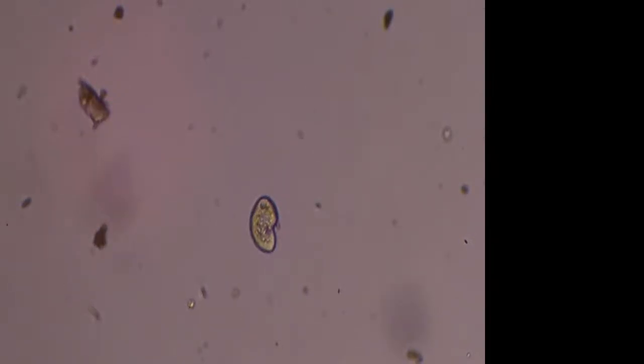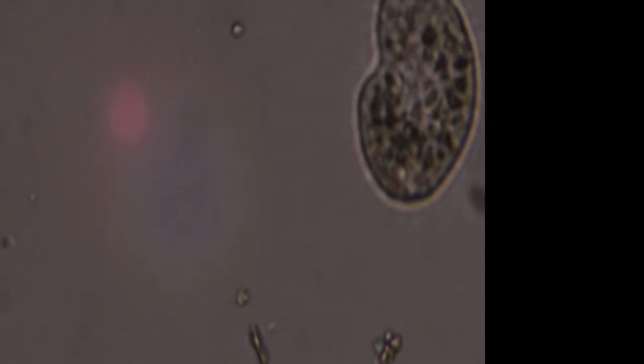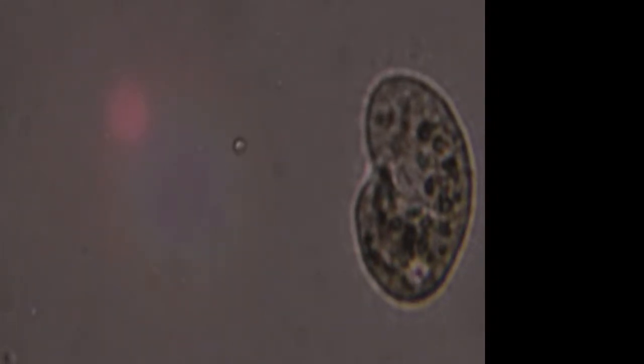So if we focus just right, and this guy's so small, I'm going to go in here. And it's not moving much. Get some nice close-ups. You can see the cilia dancing around here. Also little visitors here. Unfortunately, I got this artifact in my camera again. Oh, there you go. There's a nice view. All the dancing cilia.